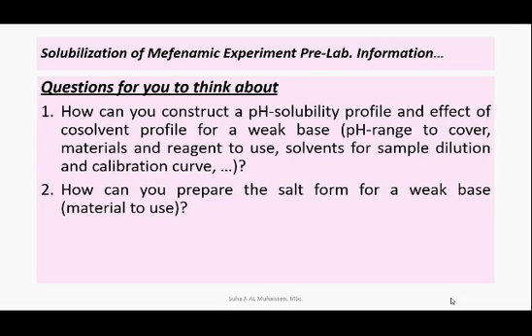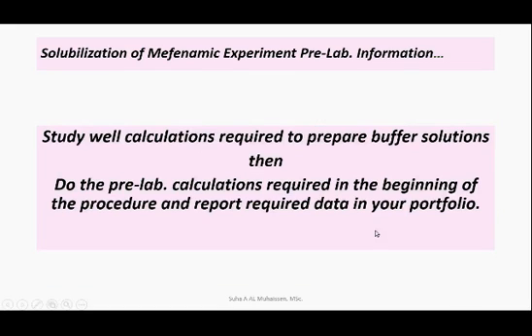Here are some questions for you to answer. During a practical session, we will discuss the calculations required to prepare buffer solutions. Then you will need to do the pre-lab calculations required in the beginning of the procedure and the required data in your portfolio reports.